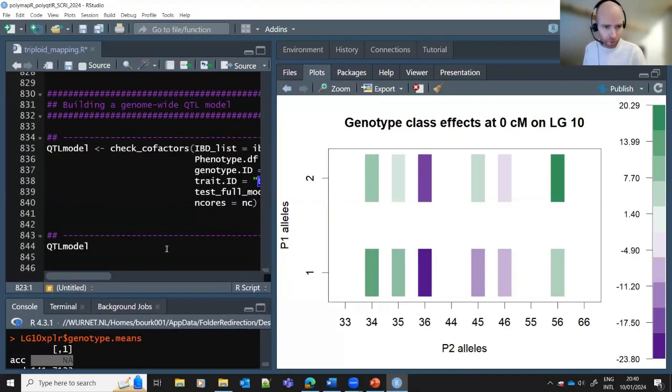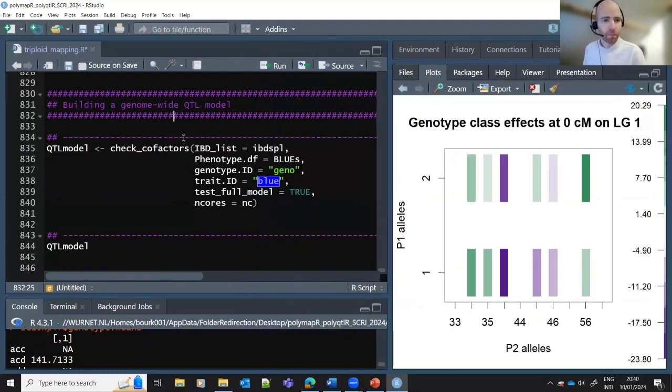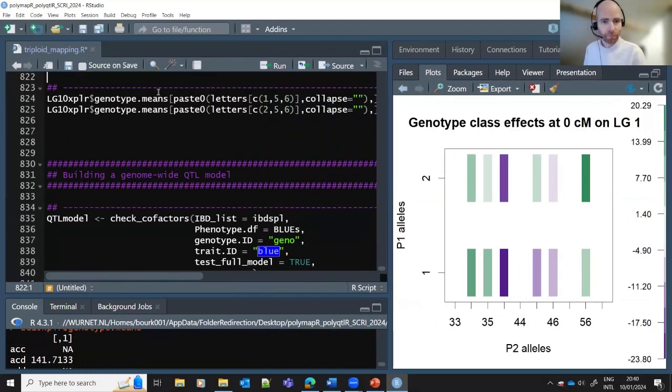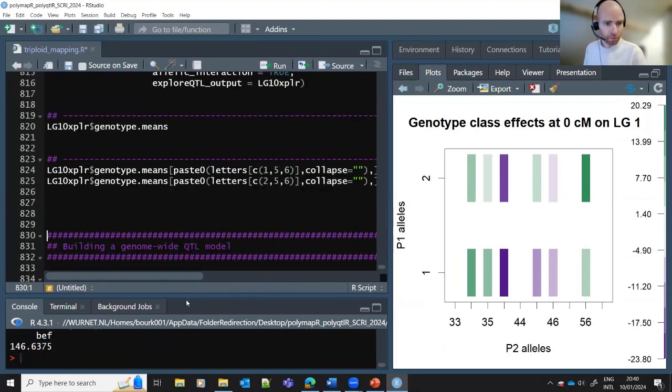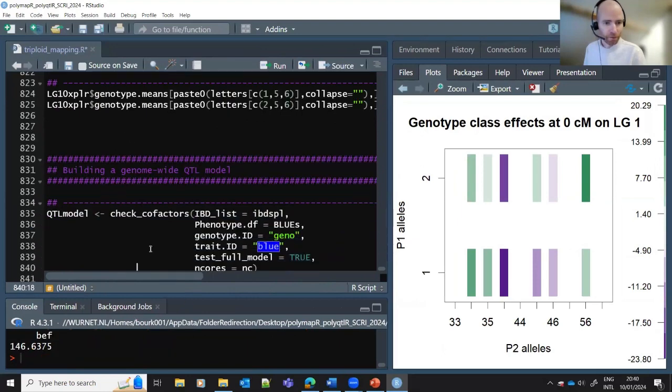Okay, now I see I've come to the end of, oh no, almost the end of this. The last step is to build this, let's see, what have I got here? Yeah, okay. Let's skip that. I think I've said that already.